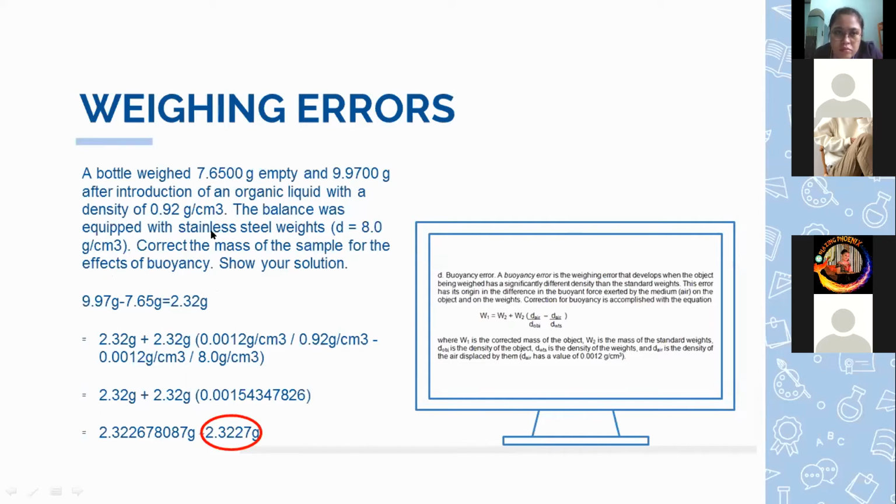So ang ginawa namin, from 9.9700 grams na nakalagay dito, or 9.97 grams, is nung meron ng laman yung bottle.